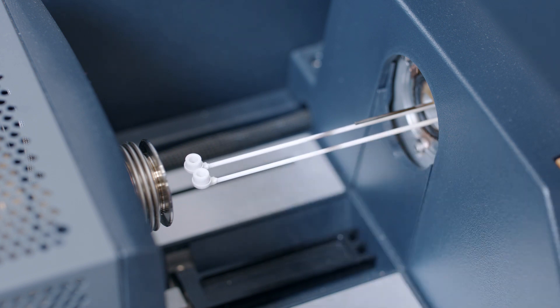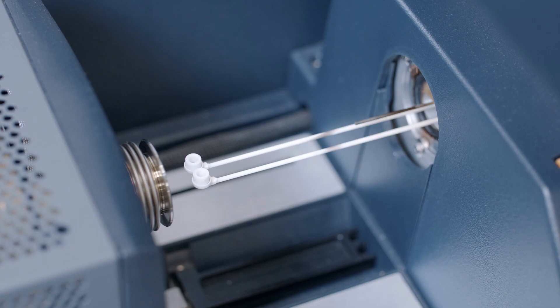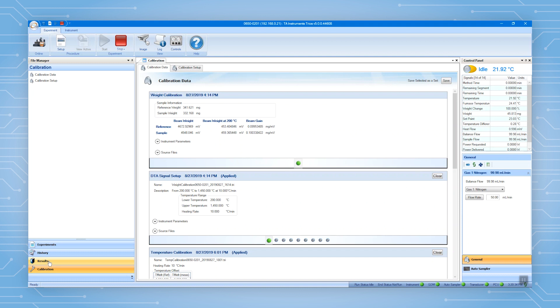Once the two runs are finished, Trails will automatically analyze and apply the calibration. You can find the applied calibration in calibration data.